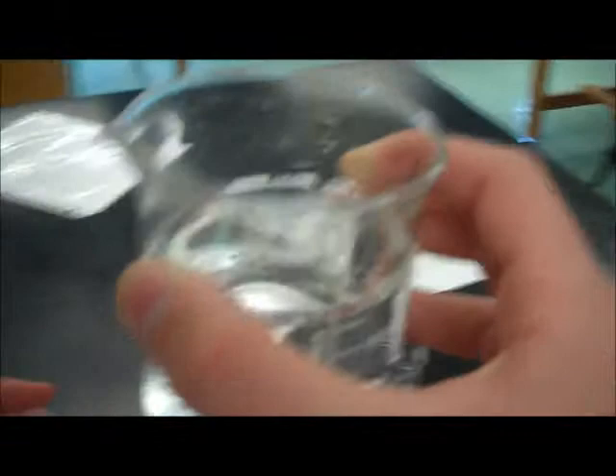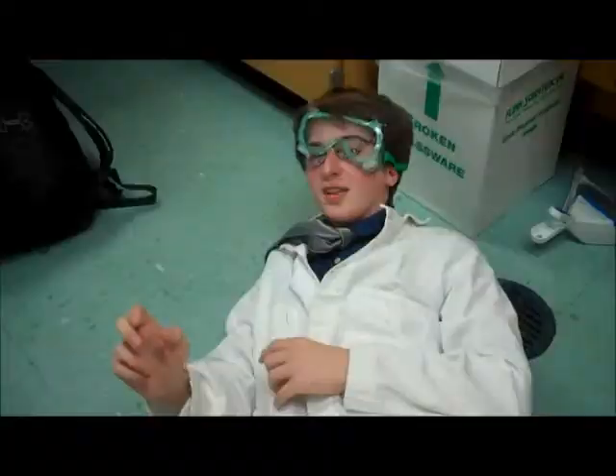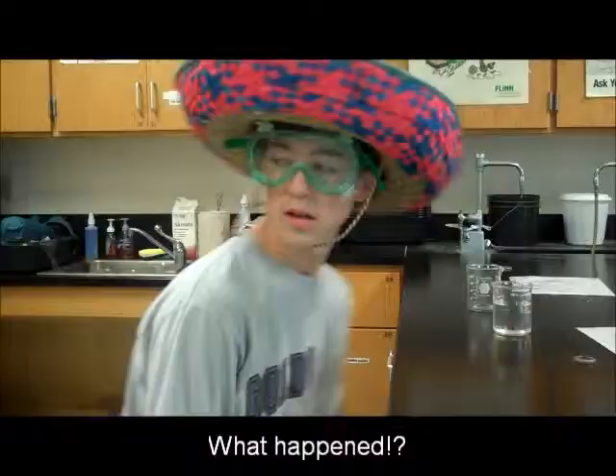This one looks like water. So once I pour this in, the liquid should turn pink. That wasn't water! Why didn't you label your beakers?